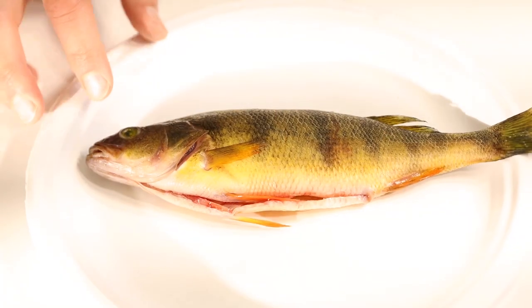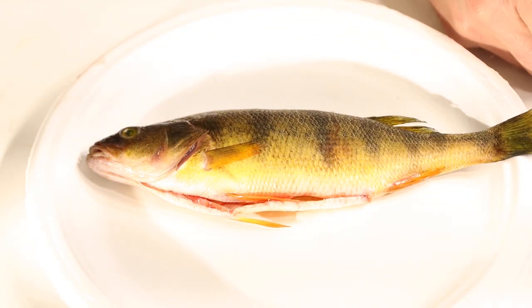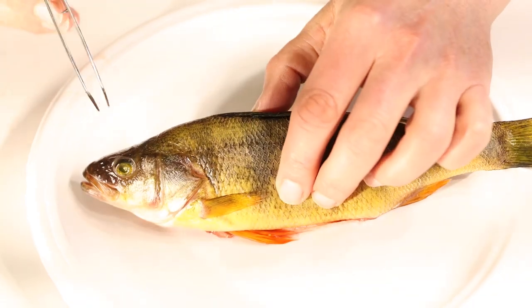It's a hard bone called the skull, and we've got to get through the skull and find the fish's brain. So to find the brain in our perch, we want to figure out where that brain would be to begin with.